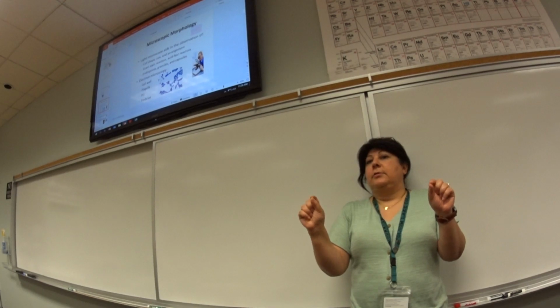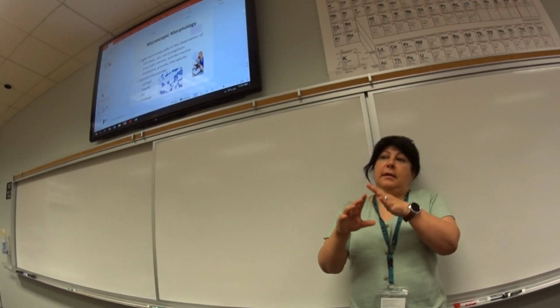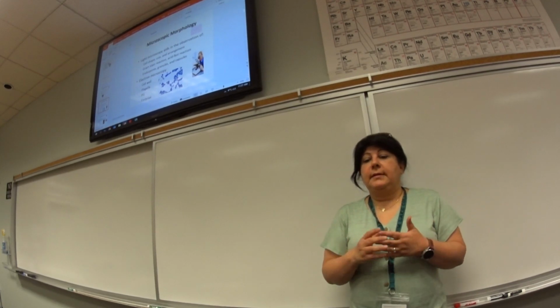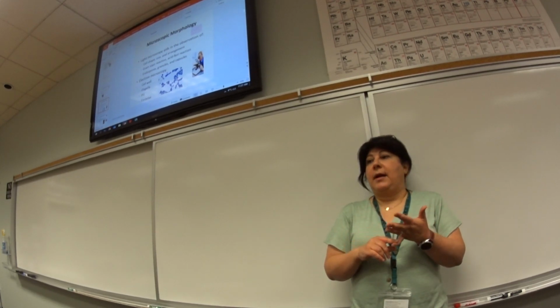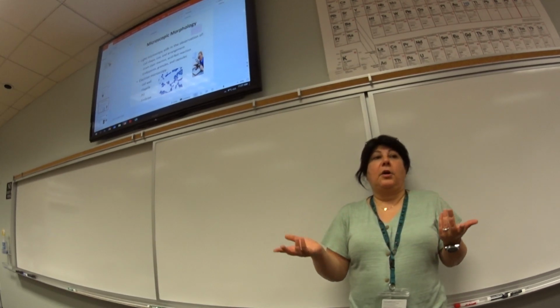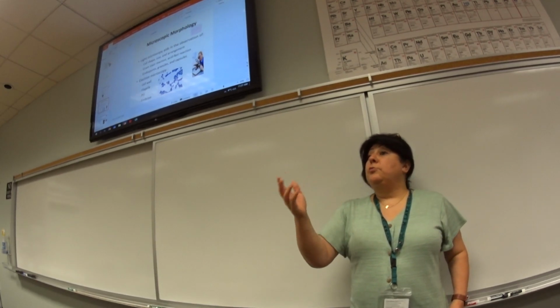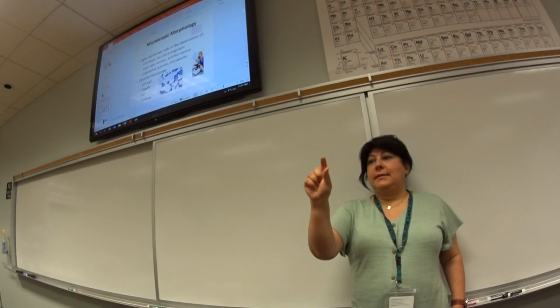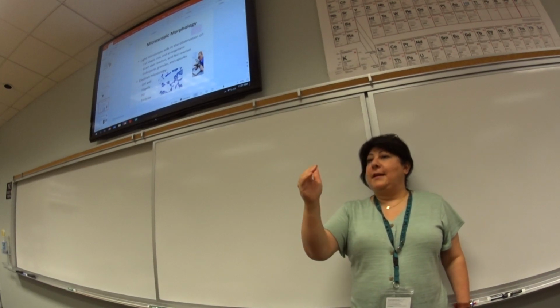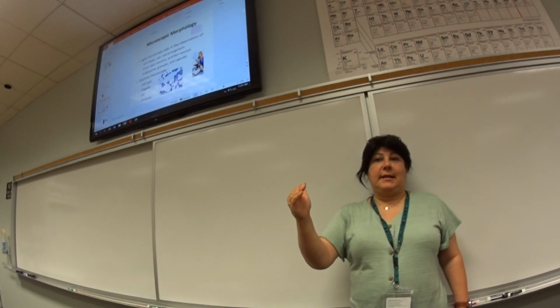Methods and materials. Today, the experiments that are going to be done, in addition to just observing the bacterial growth, are gram staining, possibly a motility test, and oxidase or catalase. So you might not do that. So start with methods, gram stain. Create a bacterial smear. Very short, tell me what gram staining is.